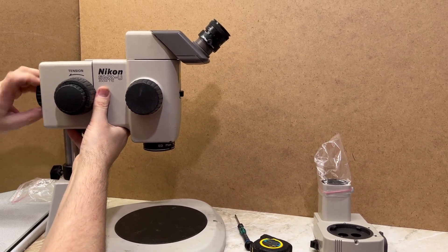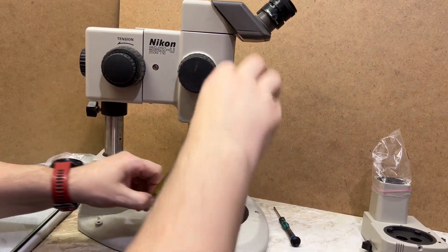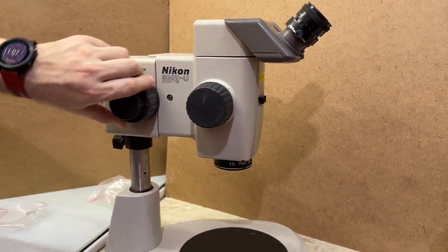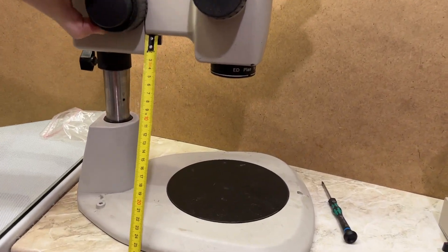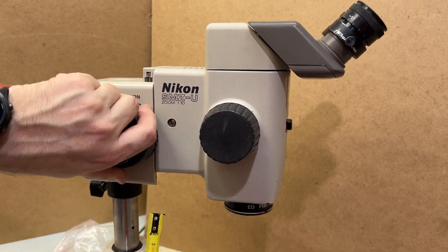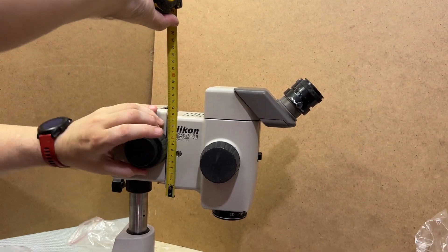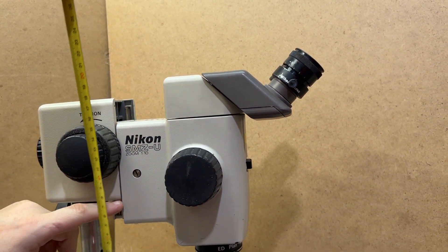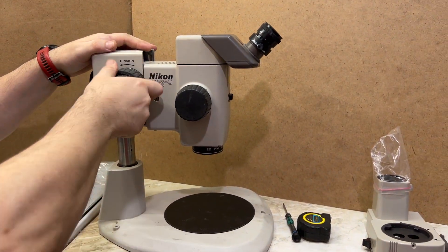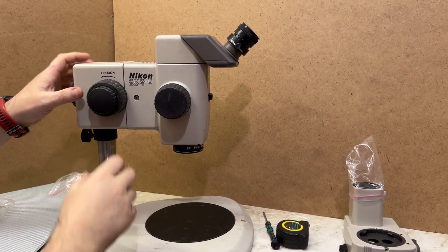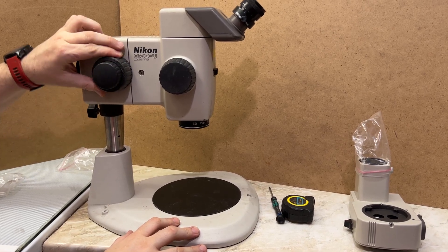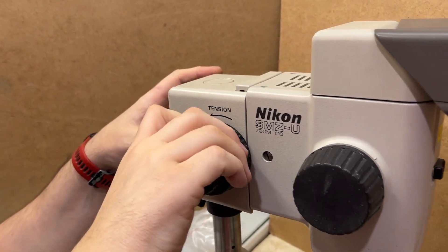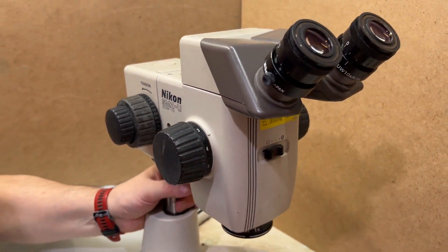Our working distance to the limiter is 13 centimeters. When we lift the microscope, the working distance gets to be 15 centimeters. While we have 15, our focuser gives us two and a half centimeters up and three centimeters down movement. Total course is five centimeters. The Nikon SMZ-U focuser has double speed dials: one dial is precise while another is used for draft movements.